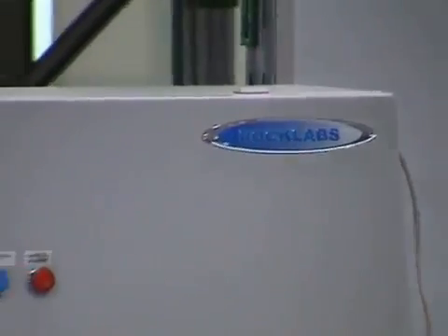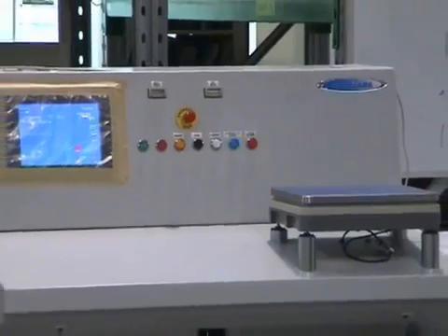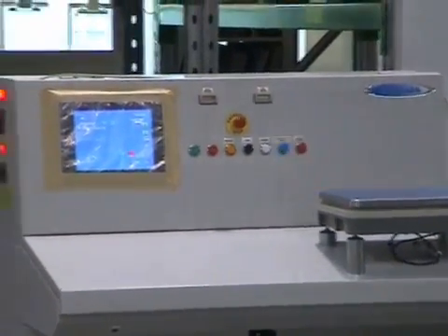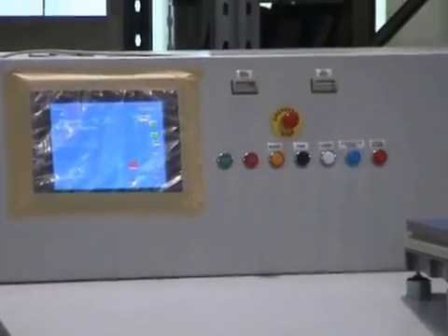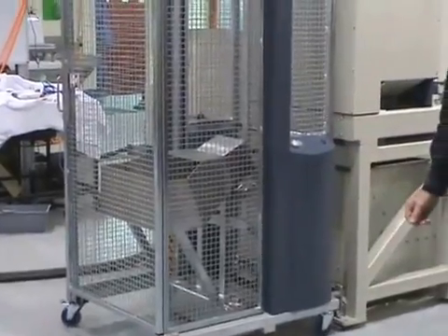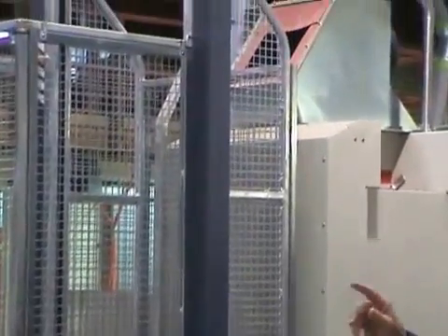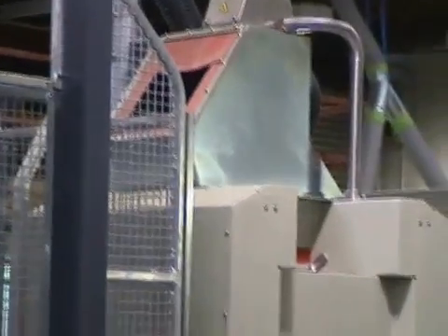We'll start with the drill core system. As with all our systems, the sample is first weighed and the weight is used to control the splitters that will follow on in the process. After weighing, the sample is loaded into the sample lifter. This has a safety door in the front so that it will not rise unless the door is closed. The sample lifter lifts the sample up to the hopper above the big boy crusher.